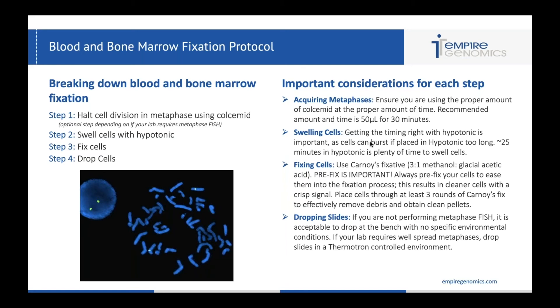Moving on to swelling cells: getting the right timing with hypotonic is important. If you leave a cell in hypotonic too long, that cell can burst. Approximately 25 minutes in hypotonic is plenty of time to get that cell to the proper size for interphase FISH. For fixing cells, use Carnoy's fixative. I've seen labs use different fixatives that can be too harsh or not harsh enough — when it comes to blood and bone marrow, always use Carnoy's fixative: the three-to-one methanol to glacial acetic acid.